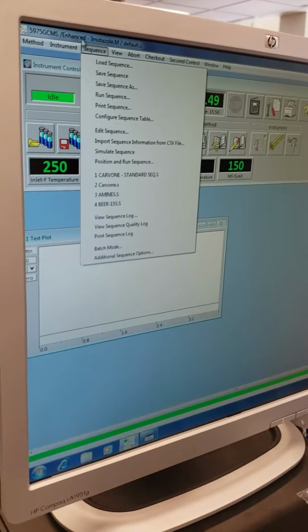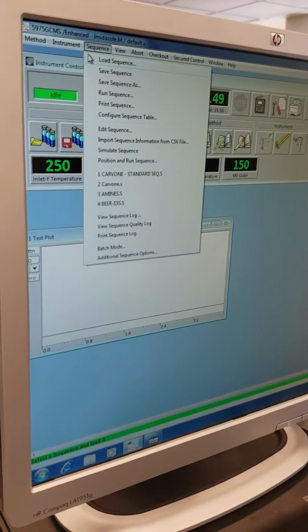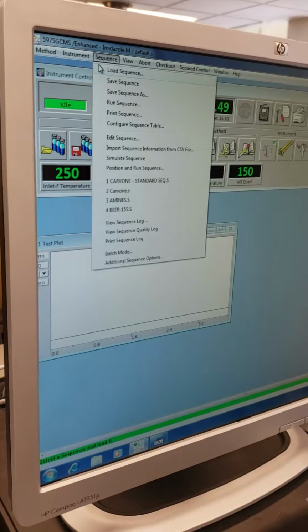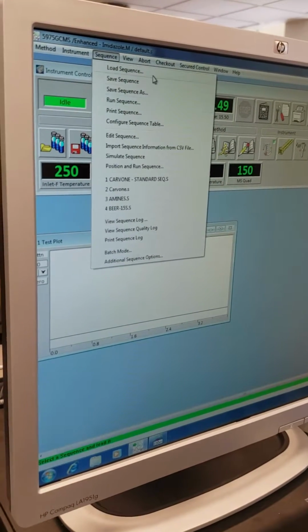Oh, okay. And I mean, if we have two samples, it's, oh, you don't know how to do that. I've never done that. Well, we can do it manually. So one at a time is okay. So we don't have too many.